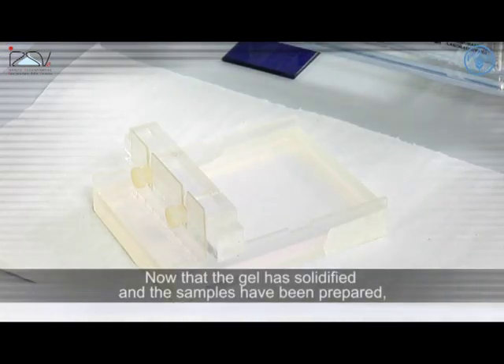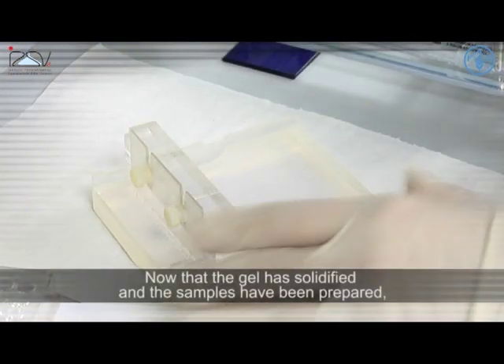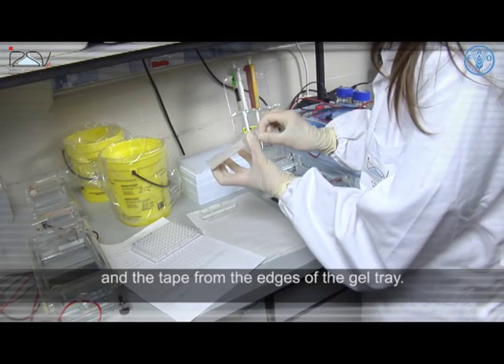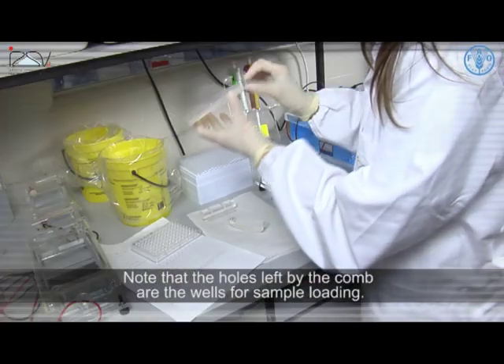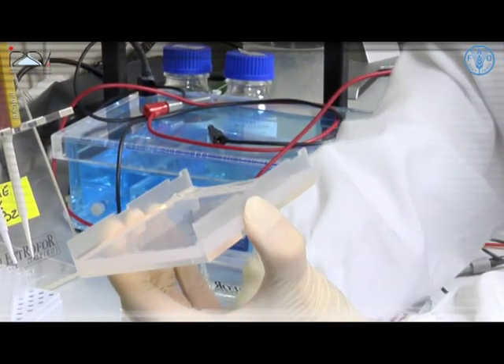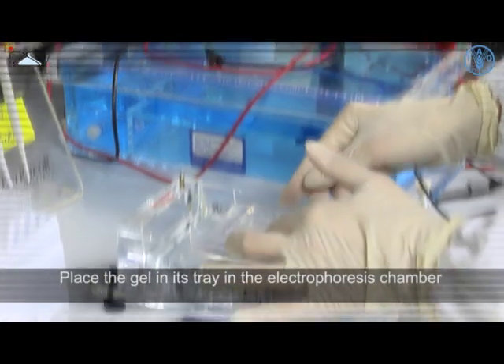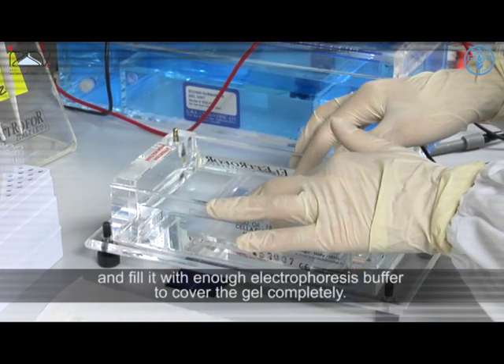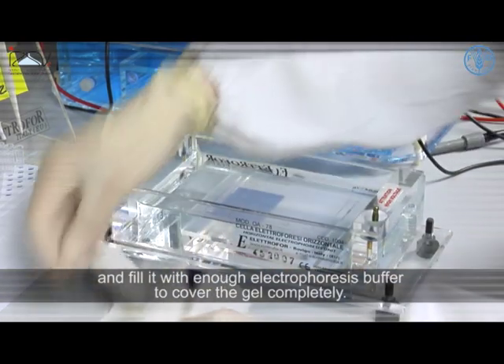Now that the gel has solidified and the samples have been prepared, carefully remove the gel comb from the solidified gel and the tape from the edges of the gel tray. Note that the holes left by the comb are the wells for the sample loading. Place the gel in its tray in the electrophoresis chamber and fill it with enough electrophoresis buffer to completely cover the gel.